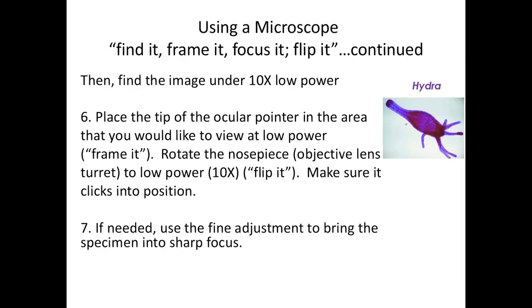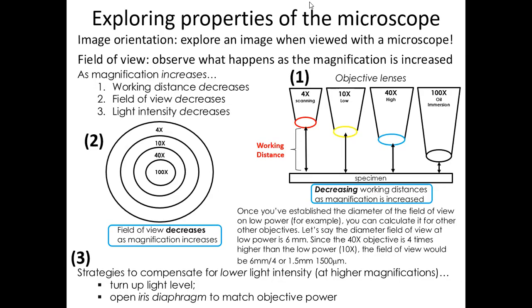So you just got to be very careful if you're doing that. All right. So let's talk about some aspects of the properties of the microscope. There, in the question set, there's some questions about when you're looking at an image through the microscope. It'll talk about what you see is like an upside down image of what's actually on the microscope. So I say upside down, and I'll see if I can pull up this. I'll show you later. It's in the question set.